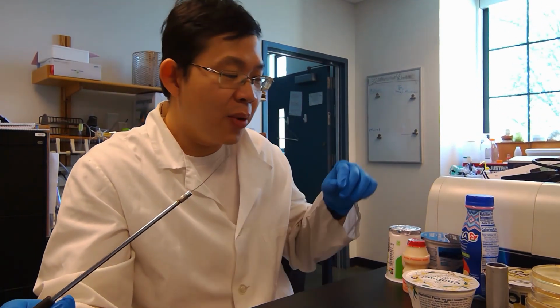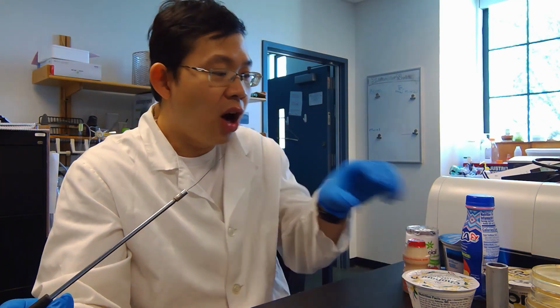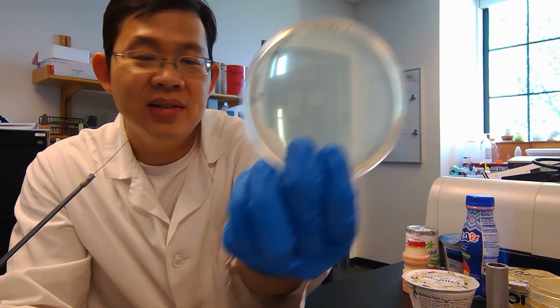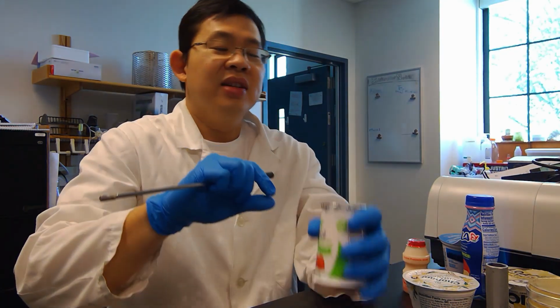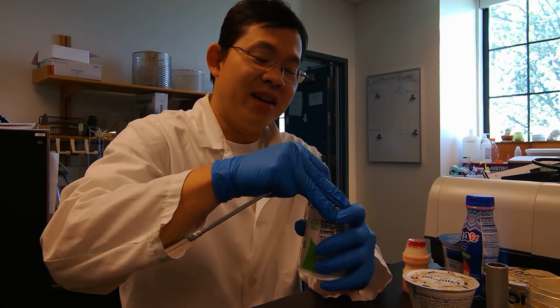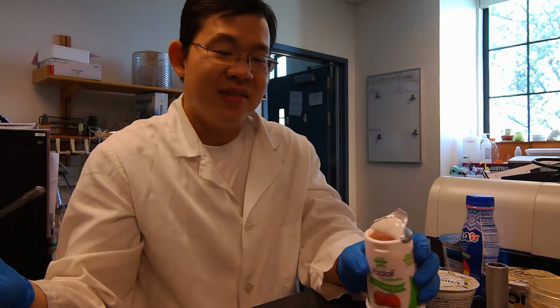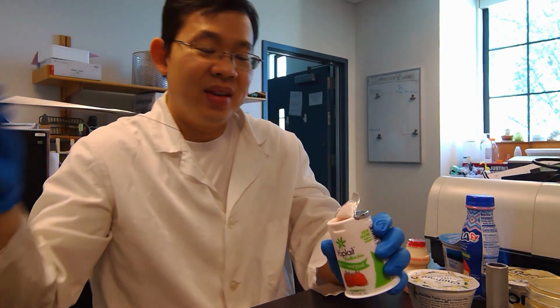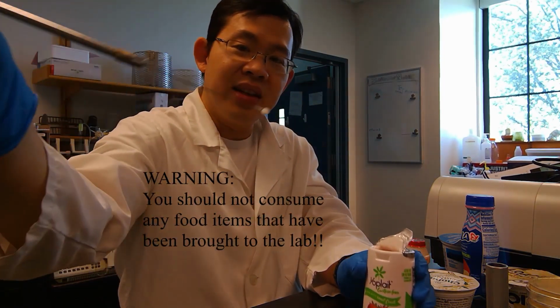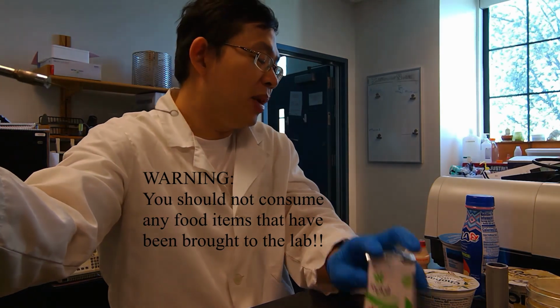So here I am going to take the yeast plate first. Here I have the label yeast plate over there. So here I'm going to take this. Let's see what we got. There, just take some sample from there, a little bit, but this is kind of too much actually, but we'll see.